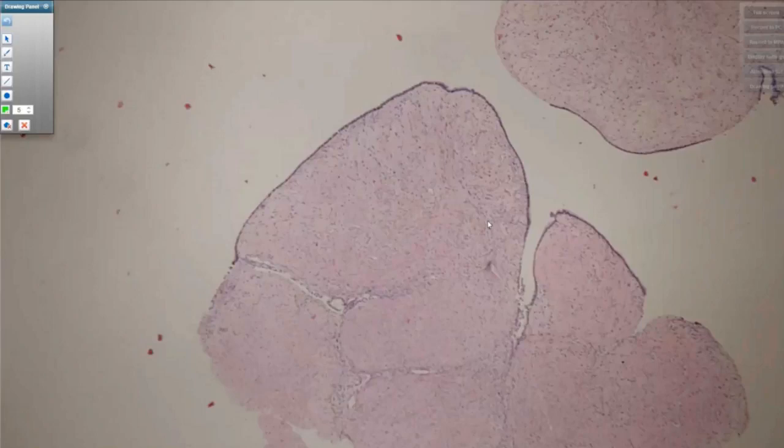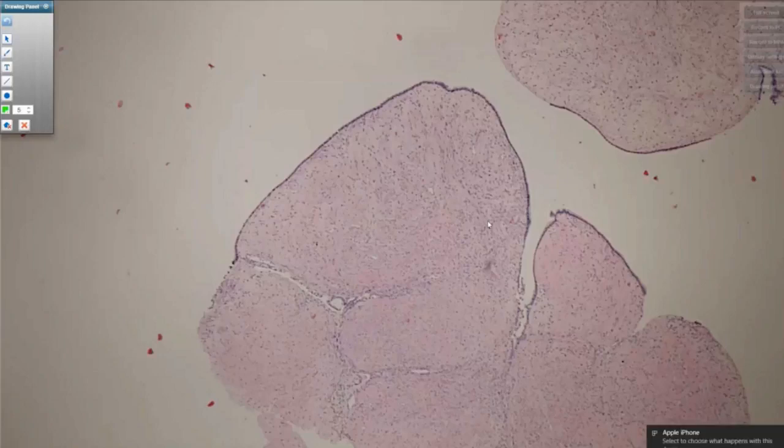So I'm using these cases to illustrate how the presence of leaf-like architecture in a spindle cell lesion alone helps support phyllodes tumor, whereas in the first set of cases we looked at, the presence of overt epithelial components such as the squamous cell component or abundant DCIS or a poorly differentiated ductal carcinoma, those components will favor classification as a metaplastic or sarcomatoid carcinoma.